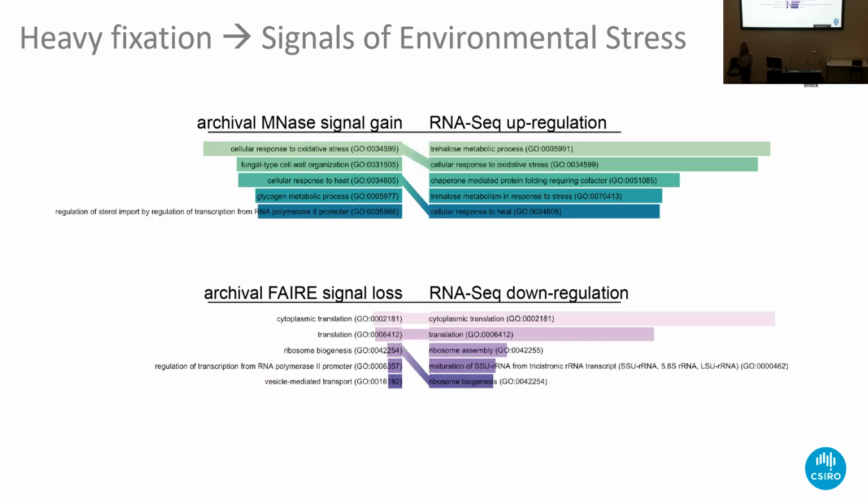Going one step further, can we infer more broad scale information from a biological perspective from these data? With RNA-seq, you sometimes do a GO analysis where you're trying to figure out which biological processes or pathways are enriched in your genes that you're seeing as differentially expressed. So again, this is looking at differential expression between heat shock and control yeast. RNA-seq is telling us that those genes that are upregulated are enriched for these pathways, which all have to do with the heat shock. That's good.